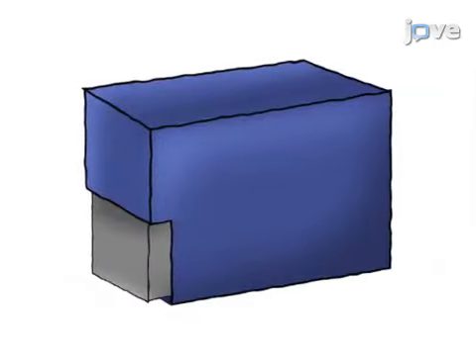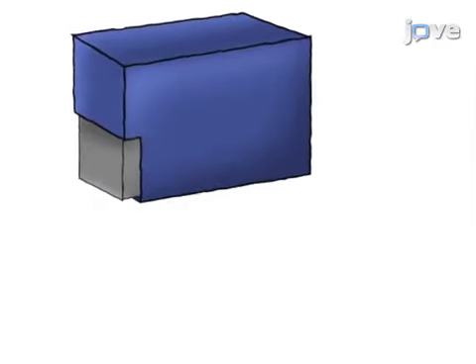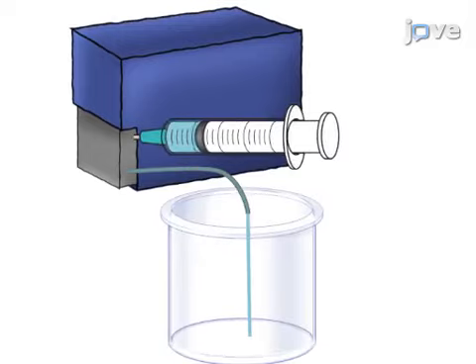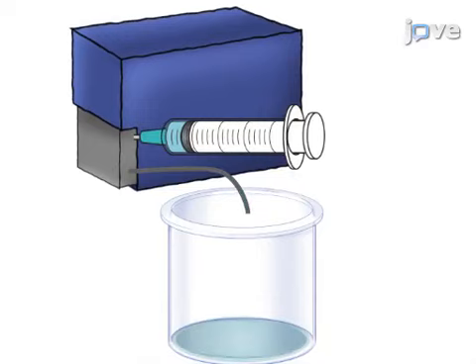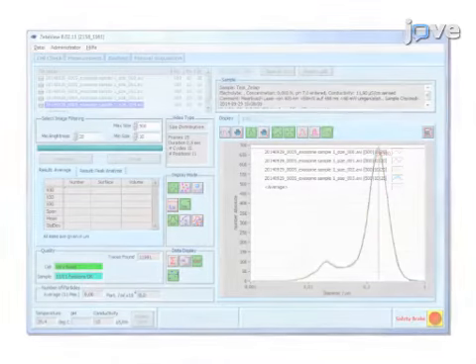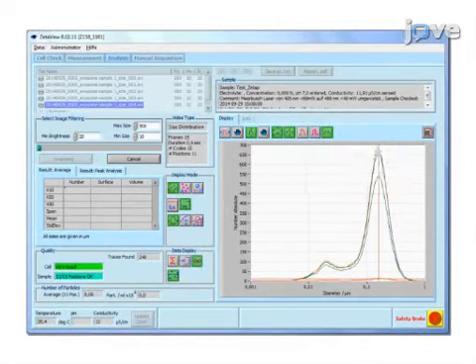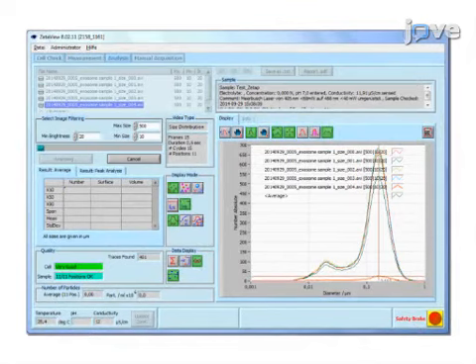The exosome solution is then injected into the NTA instrument, and the ideal setting of the NTA is selected by performing a pre-test before performing the final test. Ultimately, results can be obtained that show quantification of all measured particles and listing of the particles by their sizes.